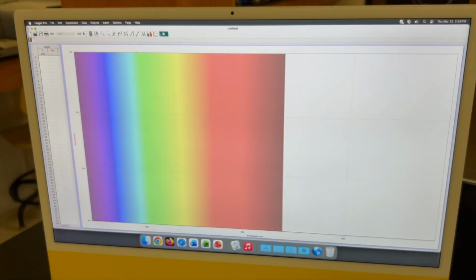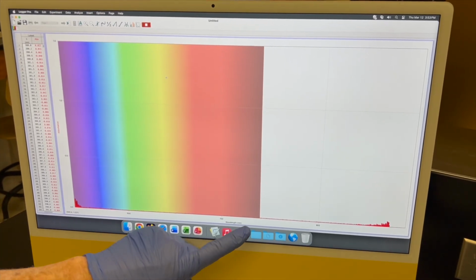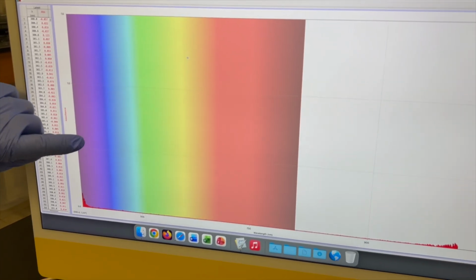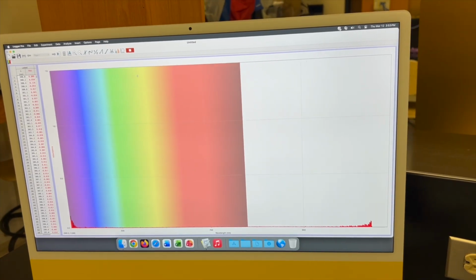I have a little play button, so I'll click play. What this does is show the calibration. Just for fun, we're looking at calibration. Calibration means that it's going to set everything to 0. You notice we have a little bit of trouble here. If you were measuring wavelengths right here, around 380, we probably wouldn't be able to use this spec. However, we're measuring at 580, so we'll be fine to use the 580, okay?